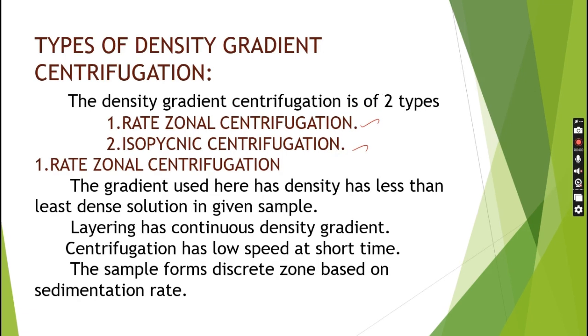Now, types of density gradient centrifugation: from its name itself we can identify rate zonal centrifugation. In rate zonal centrifugation, the separation is going to be possible as zones.